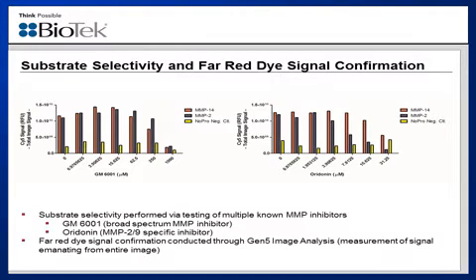As I mentioned, this eliminates the use of the cellular mask and incorporates the signal from every pixel. And again, we see the same types of decrease in signal with both the MMP14 and MMP2 substrate with increasing GM6001 concentrations, as you see here with the graph on the left.